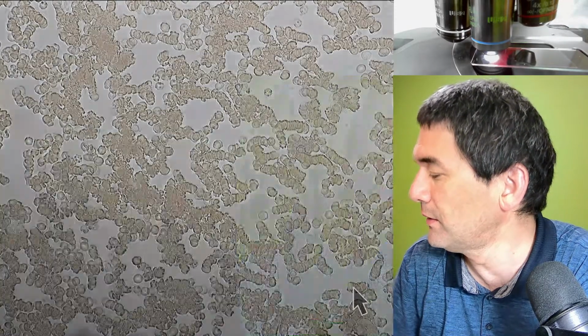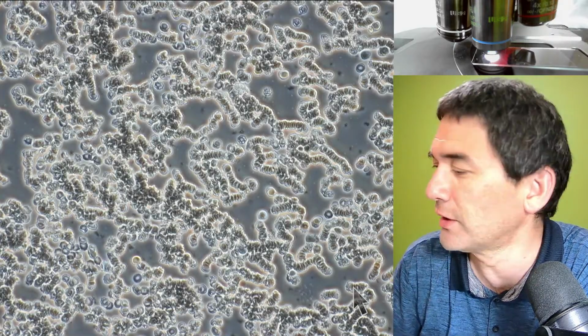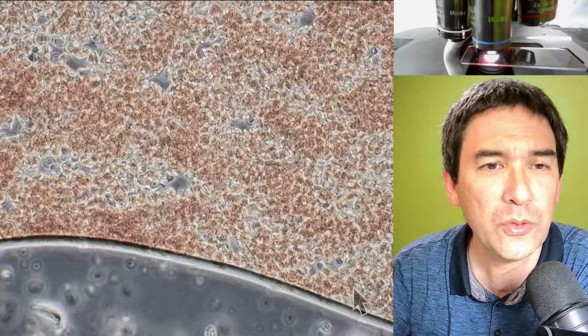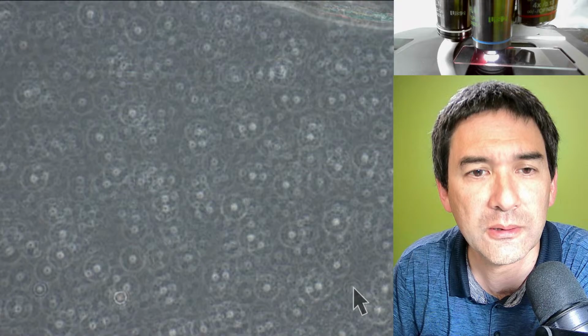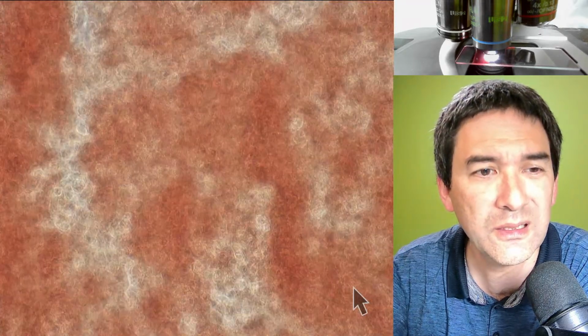And why not? I can also have phase contrast. But then I need the phase contrast filter here as well. Need to open this, and this is how it looks in phase contrast. Actually, also kind of pretty. But again, phase contrast only works best if the layers are fairly thin. Let me find it again. Ah, yeah, here. It's too thick.